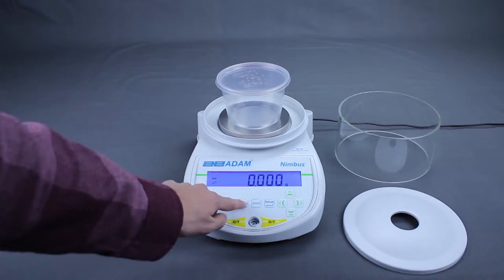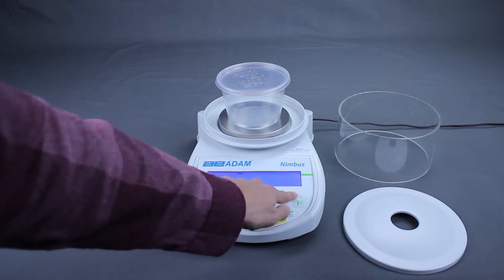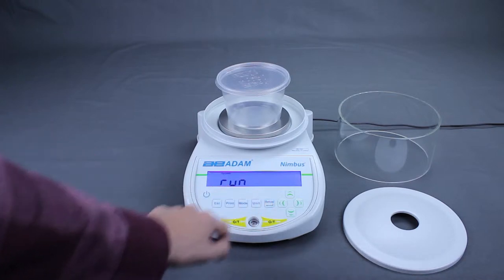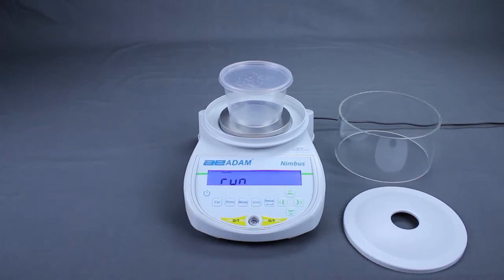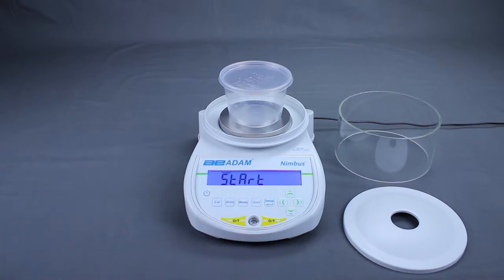Press the mode key, then use the up and down keys to display dynamic weighing. When dynamic is displayed, press the setup enter key. Use the up and down keys to display run, then press setup enter when run is displayed.